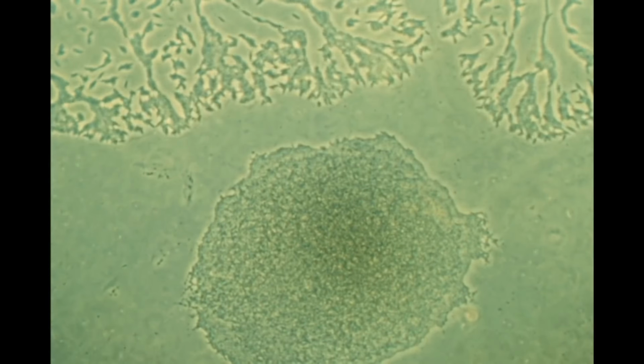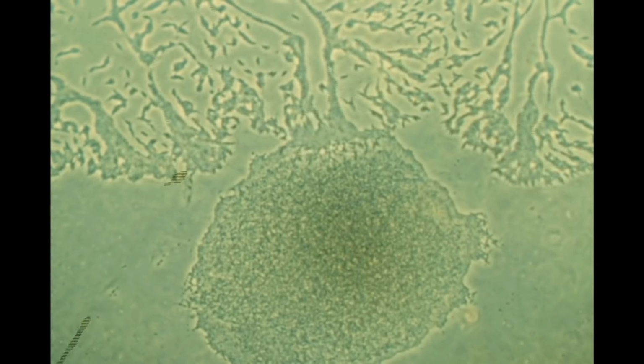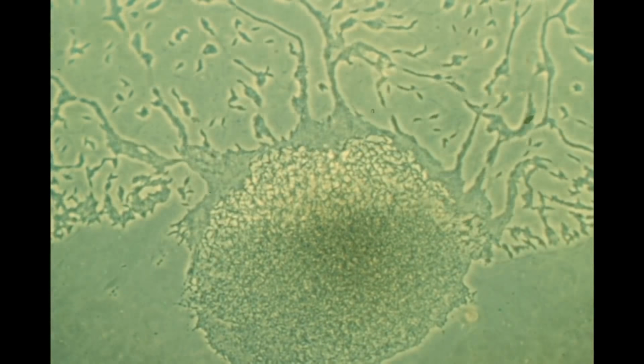But movement within the colony is altered after marginal contact has been made with food material, such as a concentration of yeast cells. The Labyrinthula cells stream toward the source of food.